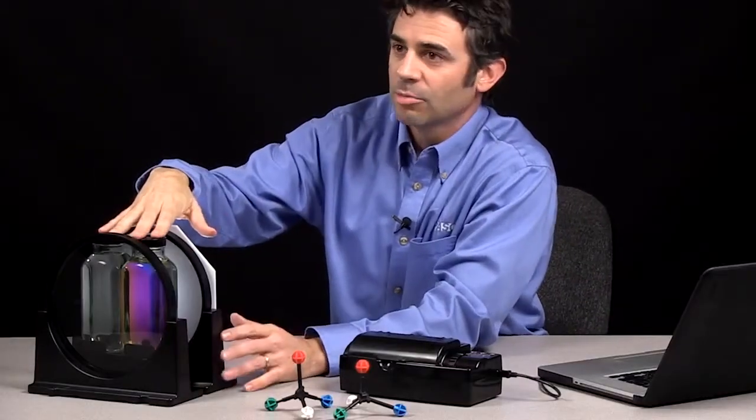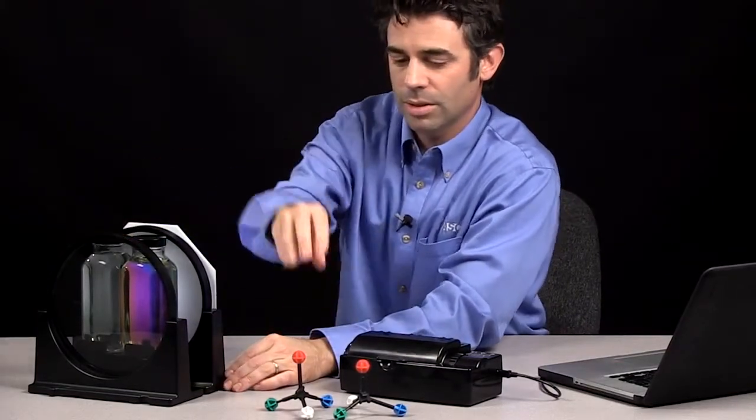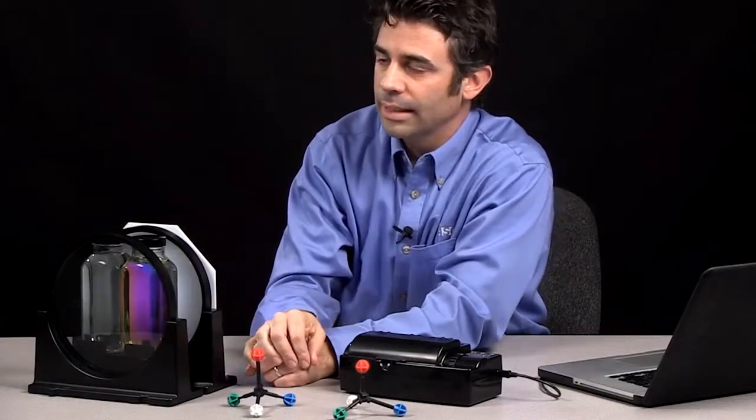So that's what I mean by rotation of plane polarized light. This is rotating the light. This is not, because there are chiral centers in the compound.